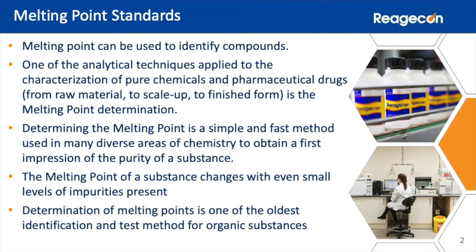The determination of melting point is also very well established as an identification and test method for organic substances. Extensive data detailing known melting point values of both pure inorganic and organic compounds is readily available through many information sources such as textbooks, chemical suppliers, websites, etc.